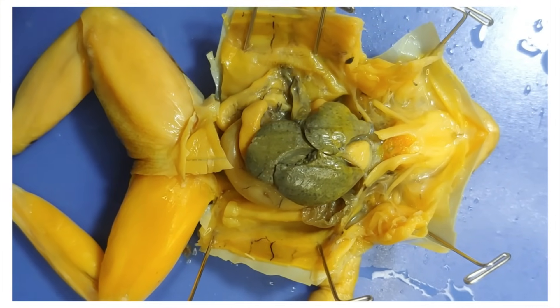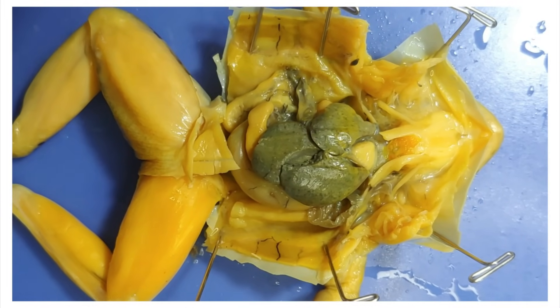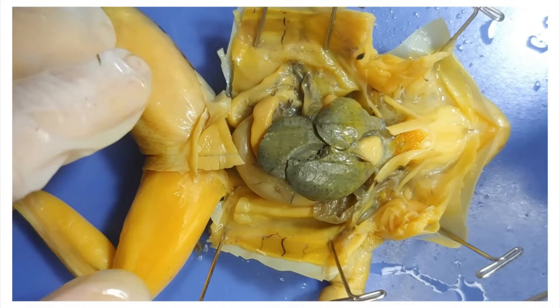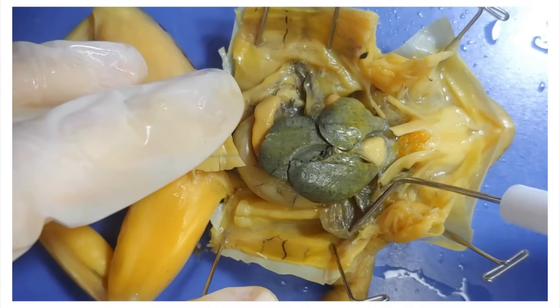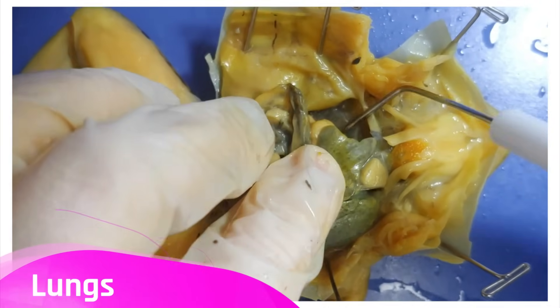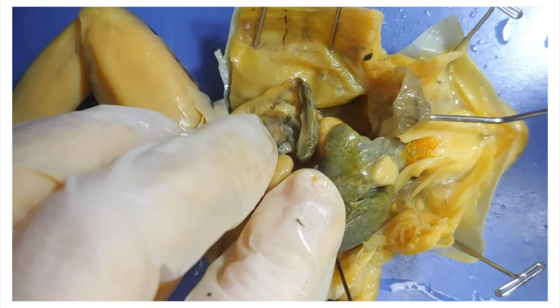In humans and other mammals, the heart has four chambers, which allows for complete separation of oxygenated and deoxygenated blood. Frogs and other amphibians can breathe through both their skin and their lungs — they use their skin to absorb oxygen when underwater, but they can use their lungs when on land. You can see the lungs here on both sides of the heart.